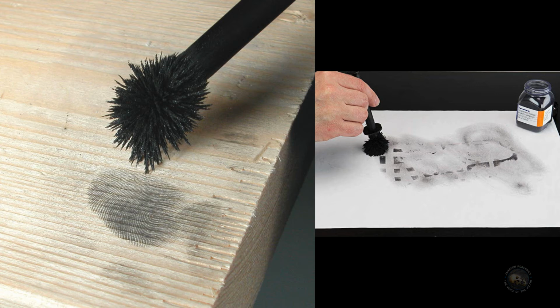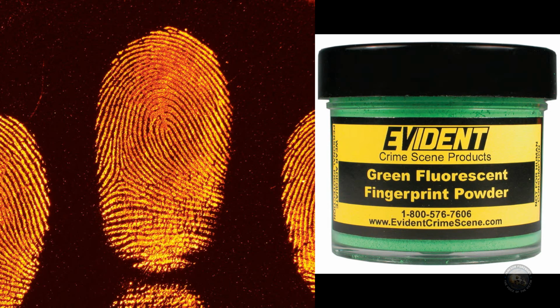The magnetic sensitive powder comes in black and gray and a bunch of other colors, and is especially useful on such items as finished leather and rough plastics, where the minute texture of the surface tends to hold particles of ordinary powder. Fluorescent powders are also used to develop fingerprints, as I mentioned. These powders fluoresce under alternate light sources. So by photographing the fluorescent powder, it brings out more contrast so you're able to see it on the photograph.